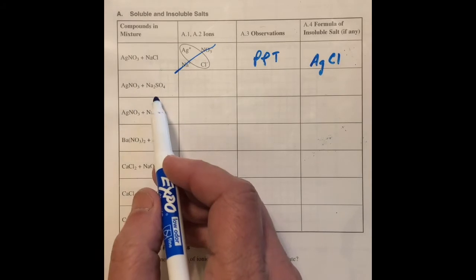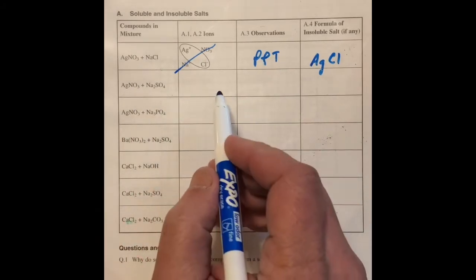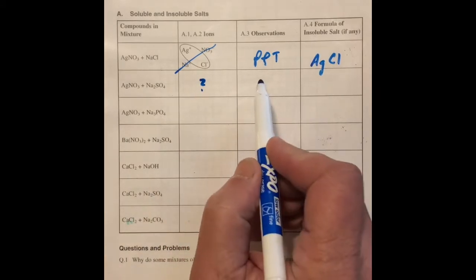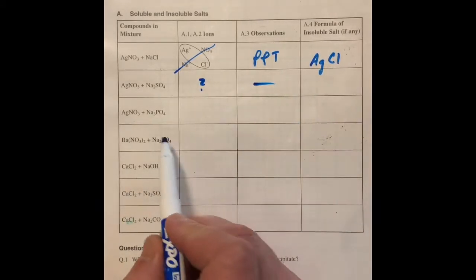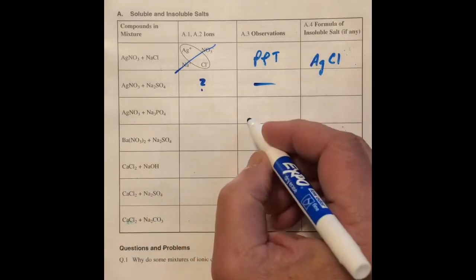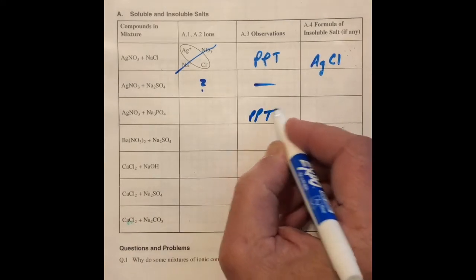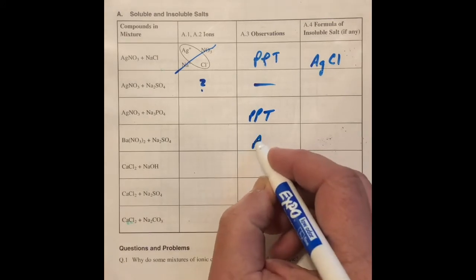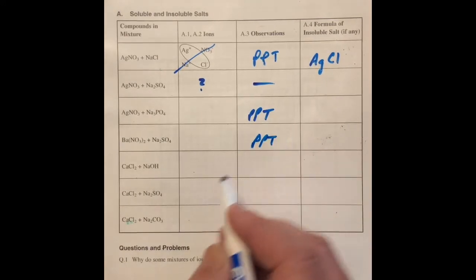All right, and then we do the same thing for each of these. So we mix silver nitrate, the sodium sulfate, and we see what happens. I guess we should write down what the ions are here, so go ahead and do that. In this case, nothing's going to happen. The silver nitrate, sodium phosphate, we see a yellow precipitate. The barium nitrate, sodium sulfate, we see a white precipitate.